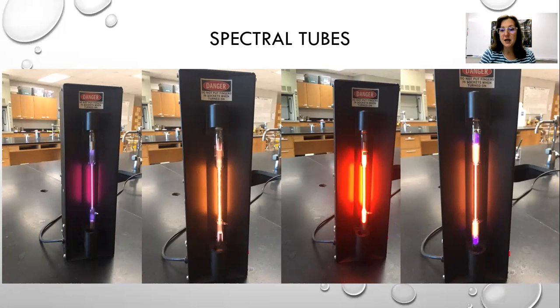The next thing we would do in class is look at these electrical boxes that I have that we can light up these spectral tubes. And each one of these tubes are particular gases, right? And those gases, again, are going to be excited this time by electricity. And we're going to get to see that emission of light coming off of them, okay, as those electrons again return to the ground level.